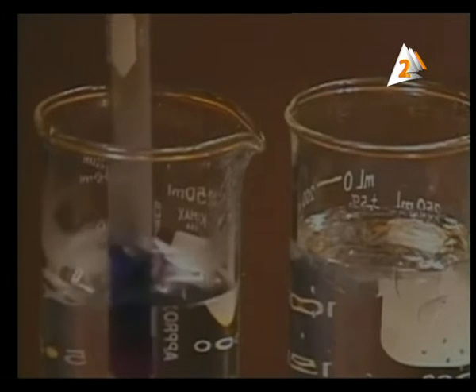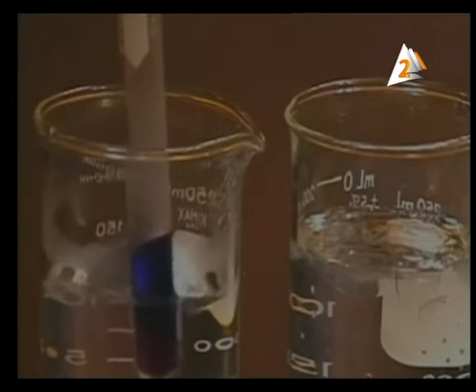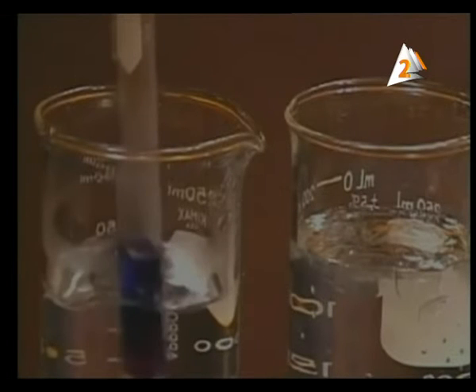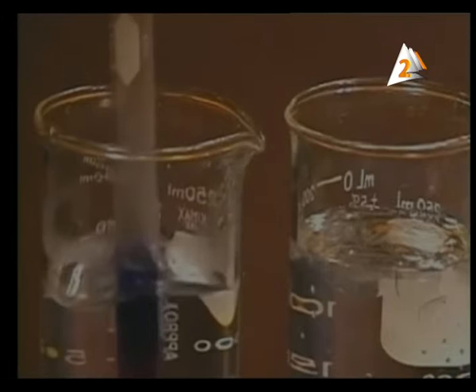Now, this is what happened. It means the shift between hydrated cobalt and the normal one, by losing the molecules of water, helps the formation of this blue color. This all happens in a normal beaker.